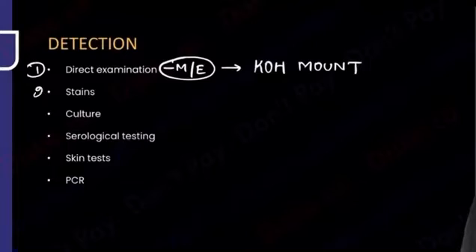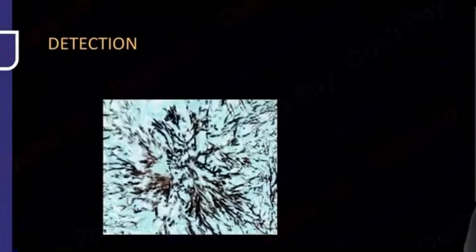The second thing that you'll do is, first you'll start putting some blue, green, pink colors. So let's start with all the stains that we have. The first one, that is quite a famous one, you can suddenly see that the fungal hyphae have become all black, right? So this stain is known as the GMS. This is known as Gomori's or Grocott methenamine silver stain.